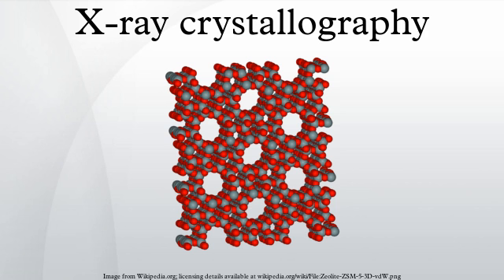image sensor. The peaks at small angles correspond to low-resolution data, whereas those at high angles represent high-resolution data. Thus, an upper limit on the eventual resolution of the structure can be determined from the first few images. Some measures of diffraction quality can be determined at this point, such as the mosaicity of the crystal and its overall disorder, as observed in the peak widths. Some pathologies of the crystal that would render it unfit for solving the structure can also be diagnosed quickly at this point.